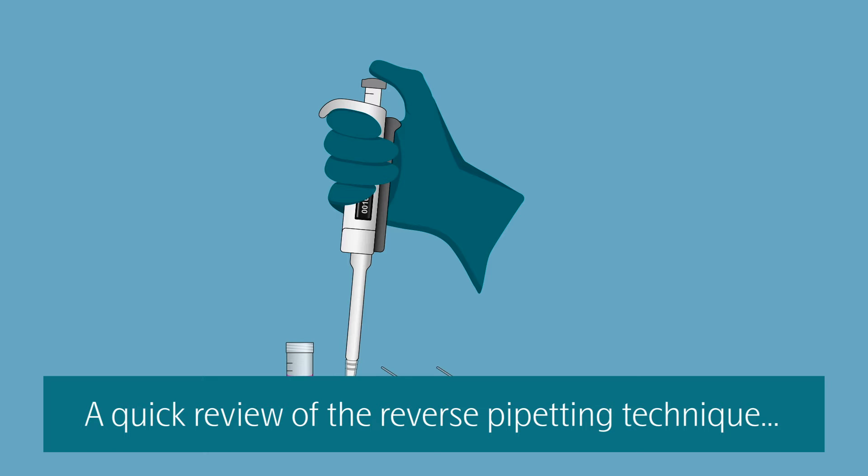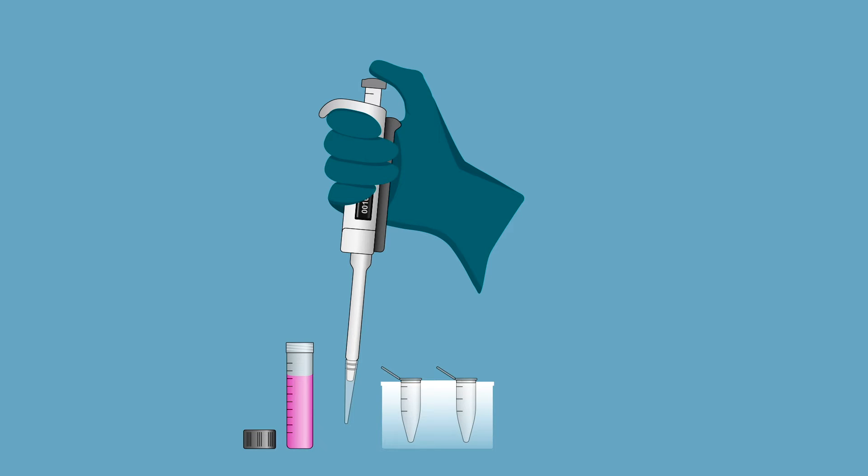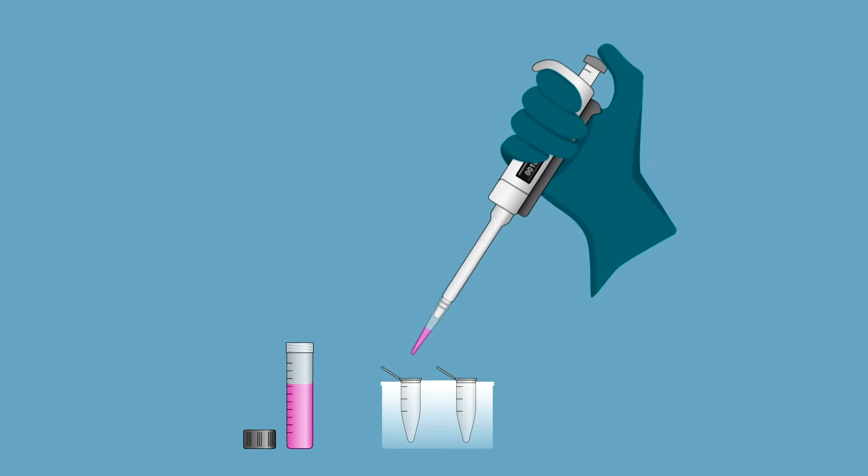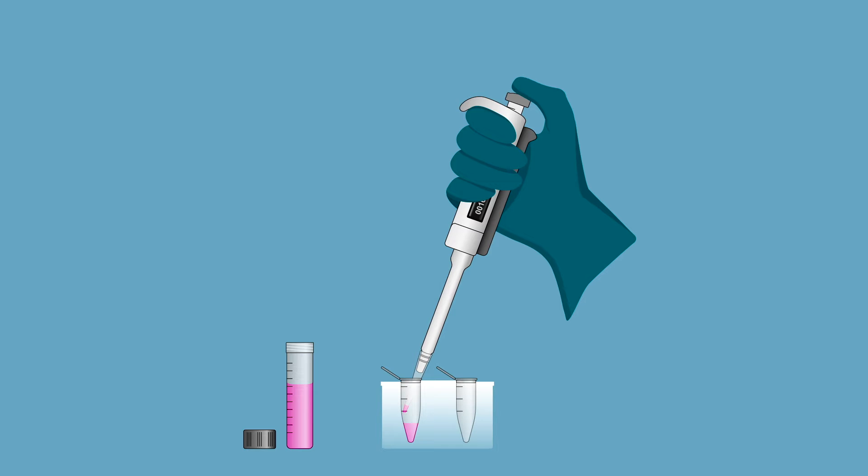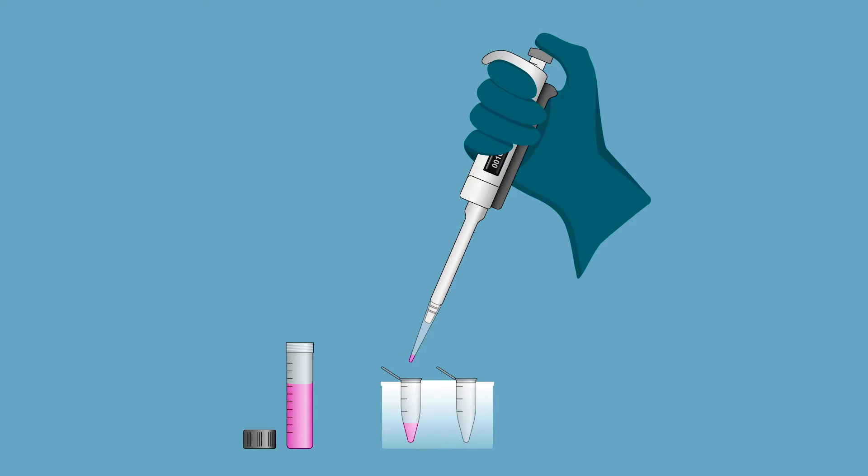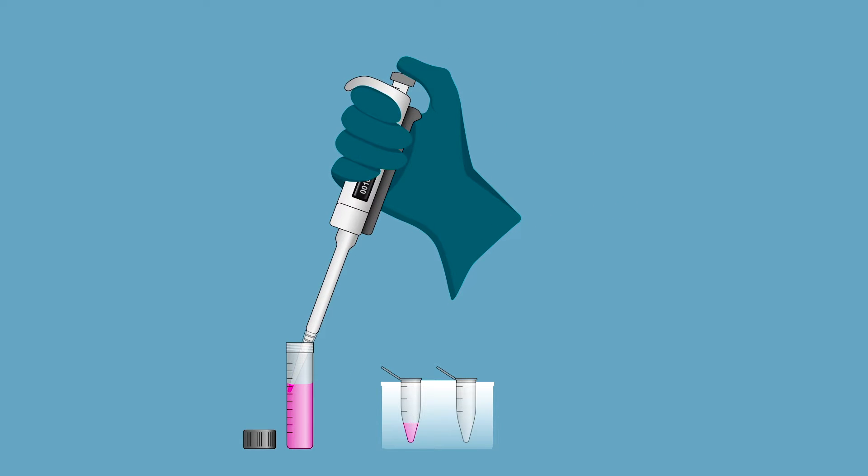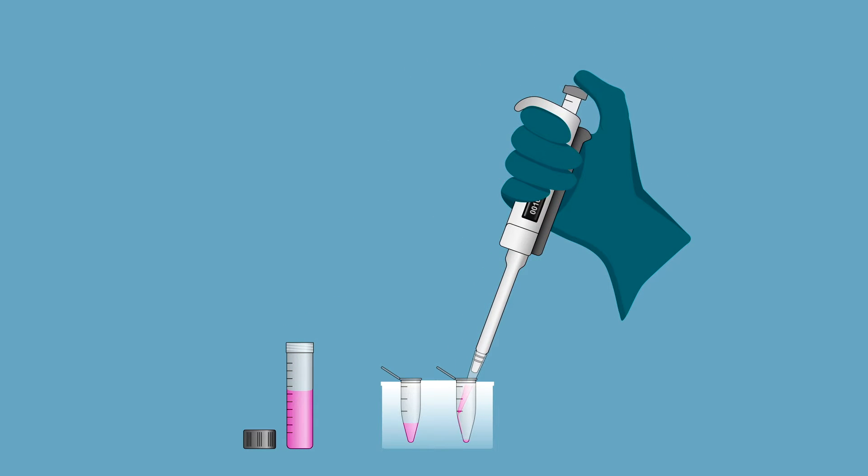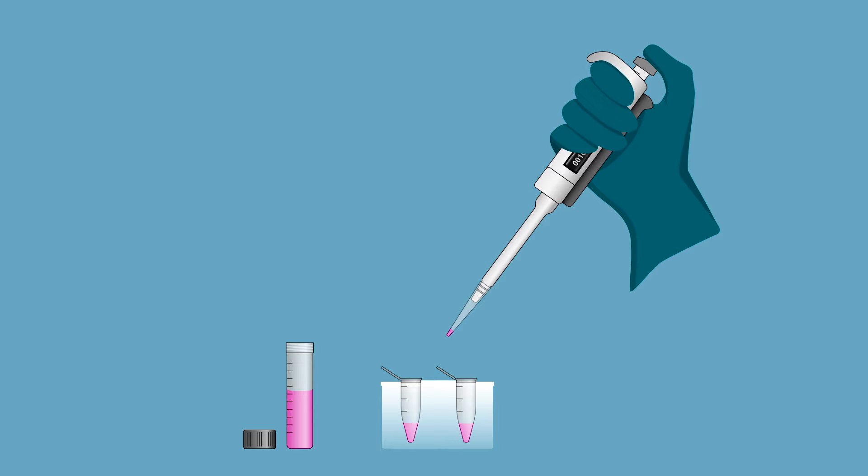In some steps of the protocol, reverse pipetting should be used. Unlike for regular forward pipetting, before aspirating your liquid, push your plunger just past the first stop. Immerse your pipette tip into your liquid, just below the liquid surface. Slowly release your plunger all the way up. When dispensing your liquid, press down just until the first stop. A small volume will be left in your pipette tip. If using the same pipette tip to transfer your liquid to another well, keep your plunger pressed down to the first stop until you put the pipette tip back down in the liquid and slowly release your plunger all the way up. Repeat as necessary. The small volume left in your pipette tip can be discarded once the pipetting is done.